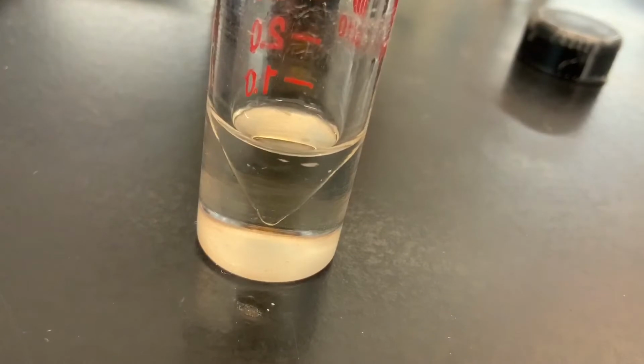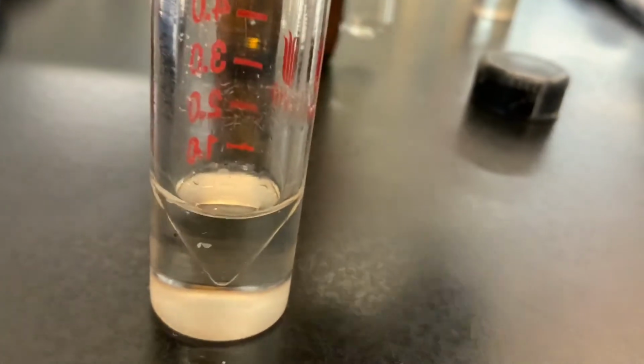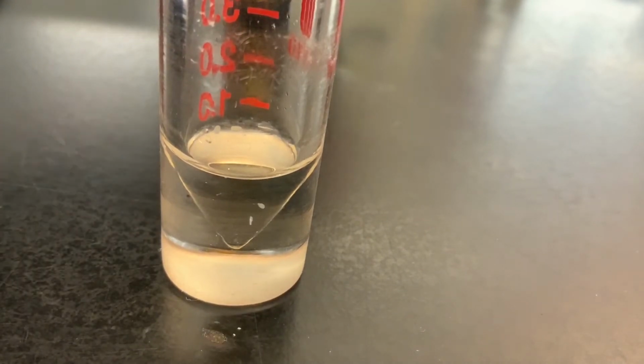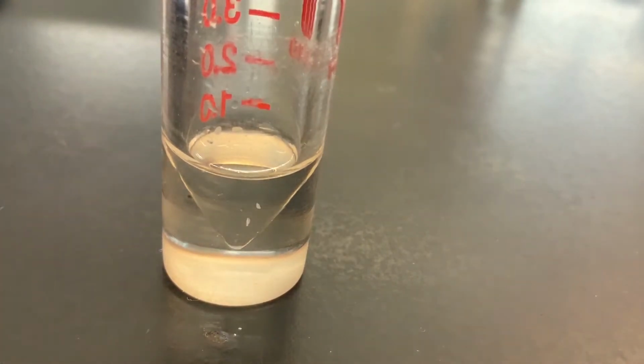But we need to wait for this all to dissolve until we add 600 microliters of deionized water. We will then see that we're going to have 2 phases. We can once again also call them 2 layers, because methylene chloride and water do not dissolve. Since methylene chloride is more dense than water, we will see that the water will float on top of the methylene chloride.